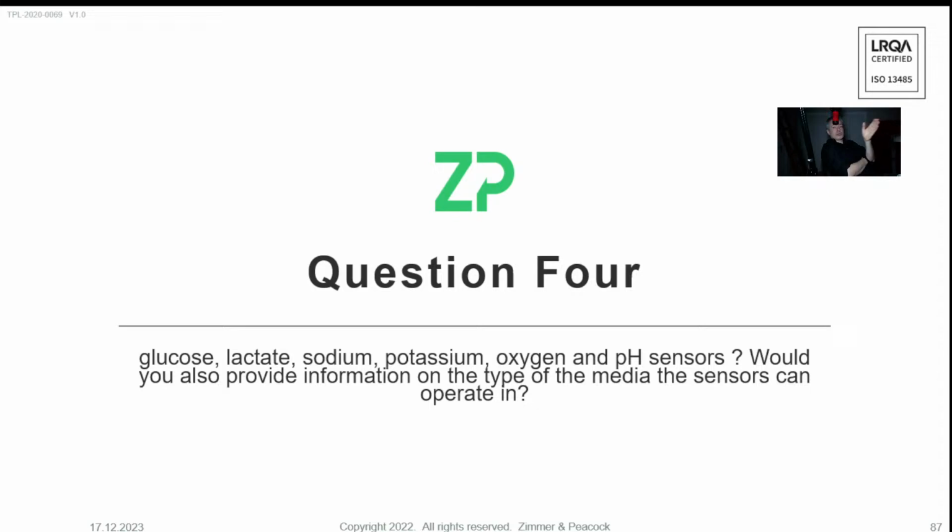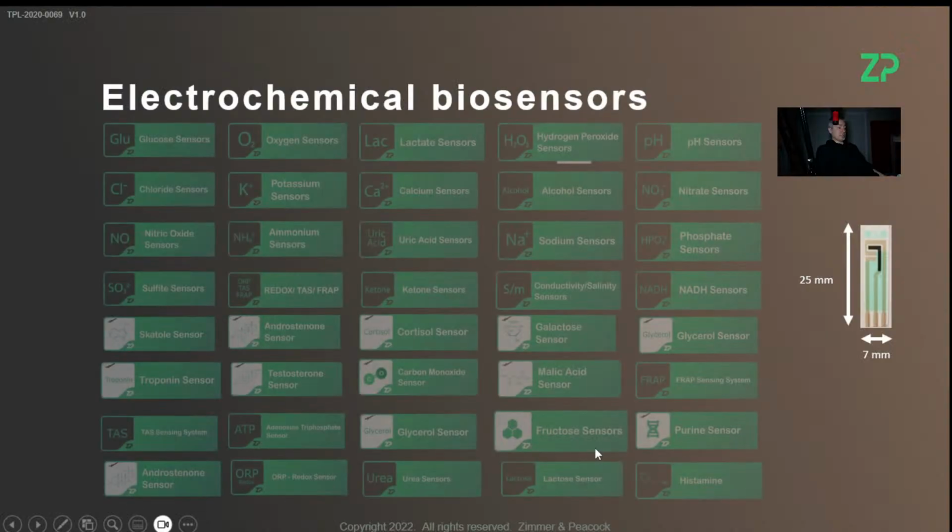And so what I want to say is that our sensors are very good for using in the liquid phase, but when you have new applications, for example measuring nitrate in soil, then you have to have a calibration routine and a sampling routine to do that. If it's nitrate in fresh water, that's actually a little bit easier, but you still need a different calibration because it's a different sample, a different matrix. So we have these sensors, but you still have to do some work depending on what the actual application is.